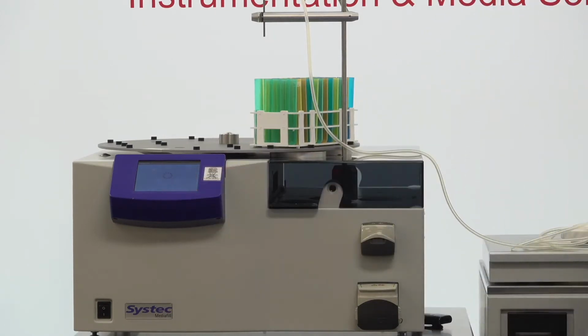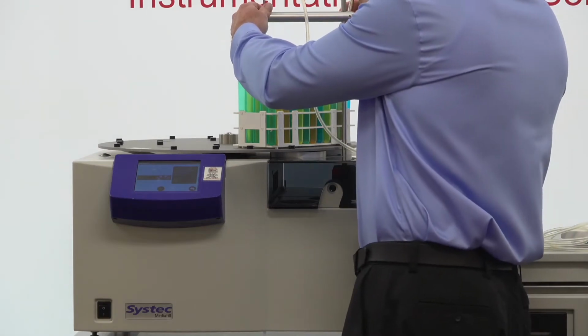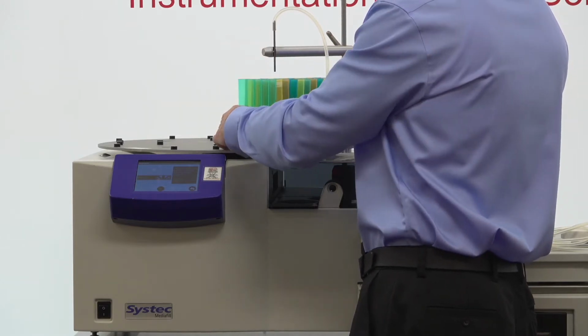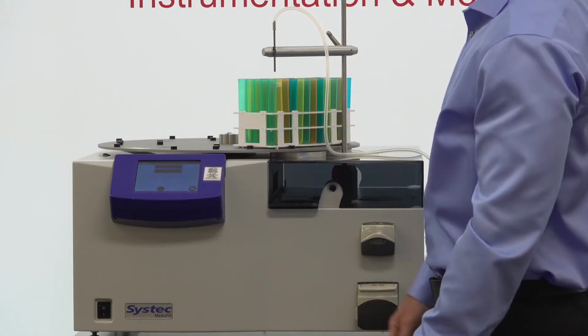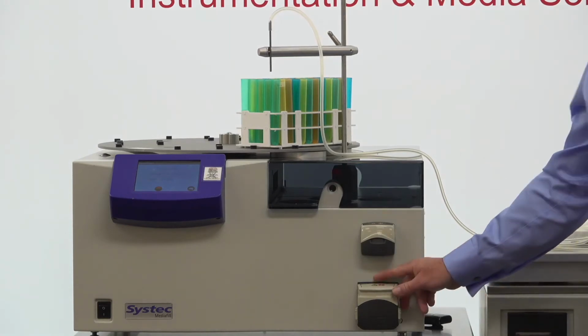Just hit go. It will move the tubes into the first position. Then we can manually move the dispensing arm. Once we've manually moved the dispensing arm into position, now it's based over the first tube. Once that's over the first tube, we can just hit go. And now it's going to go ahead and dispense our tubes for us here.